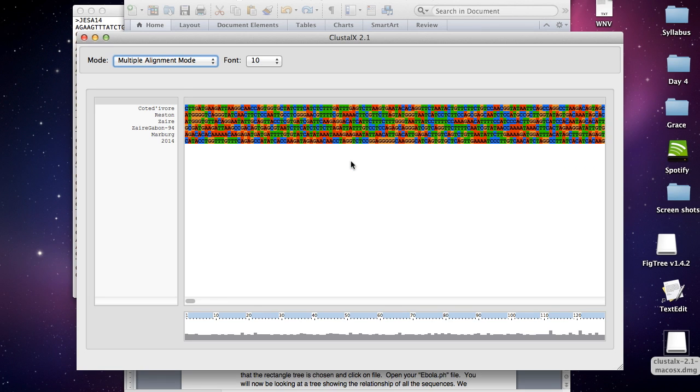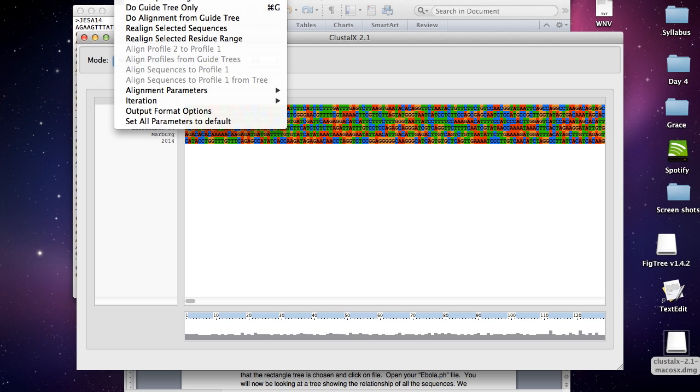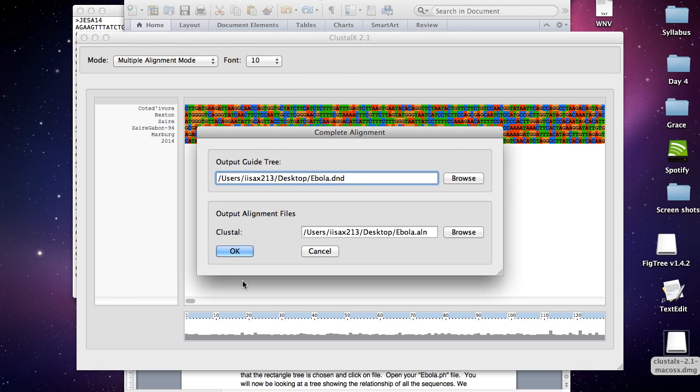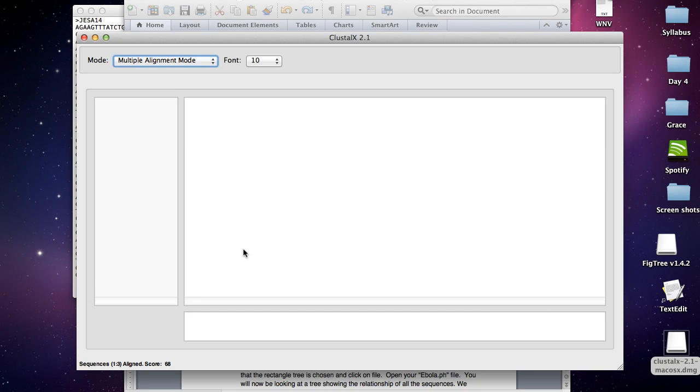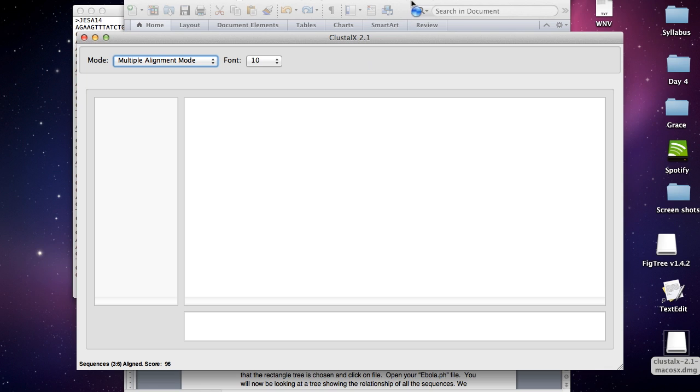I'm going to open up Ebola. Here are all the sequences. To align the sequences and find where the common regions are, you're going to hit alignment and hit do complete alignment. Then you can save the DND and the ALN, hit OK. This generally takes a pretty long time, so we're not just staring at a blank screen. I'm going to stop the video right here and pick up when the sequences are loaded. I'll be right back.